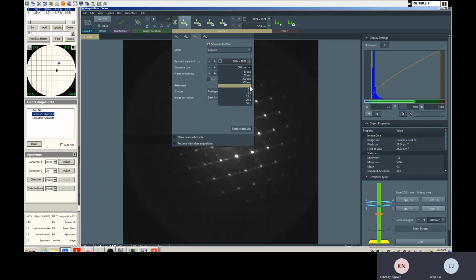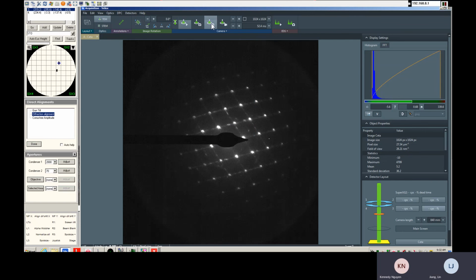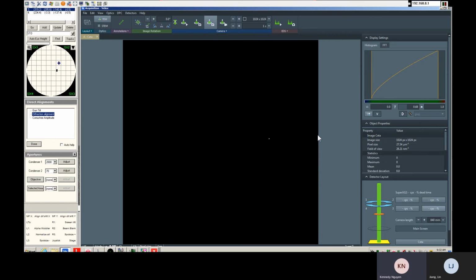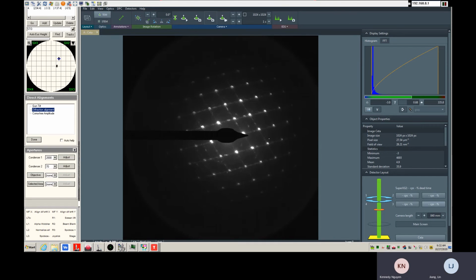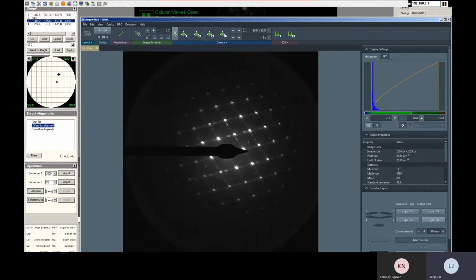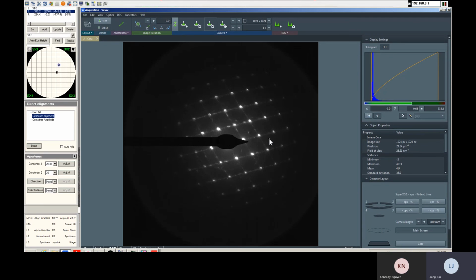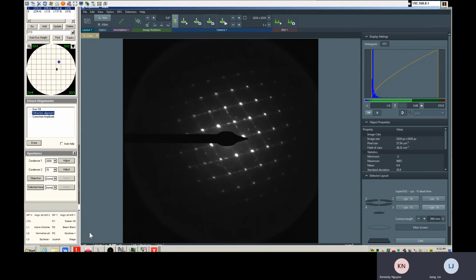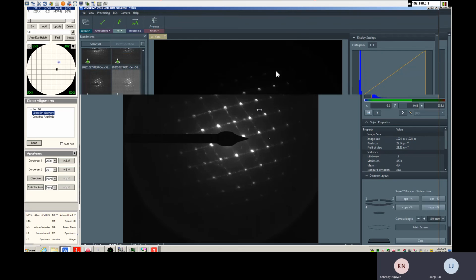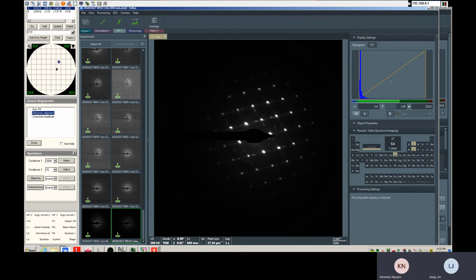Okay, diffraction. Let's bring the beam first. I don't want to damage the sample because we condense the beam. See data? Looks good.